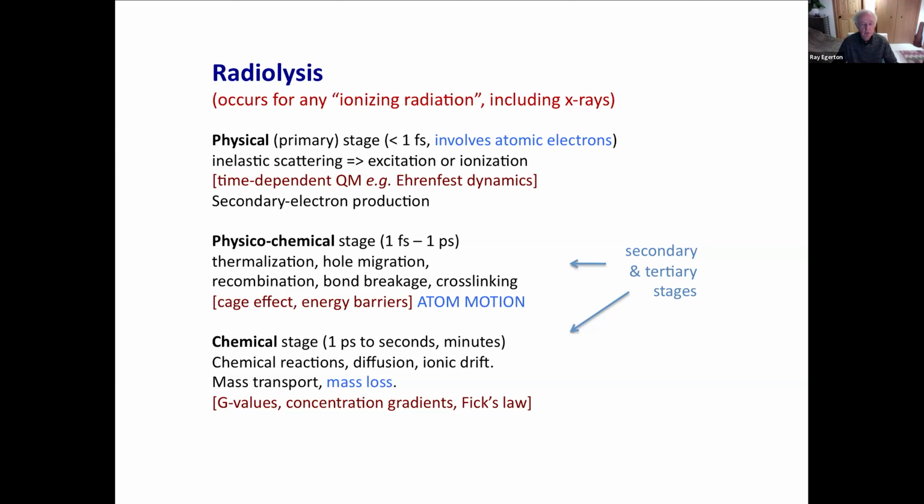And that's when we start to see effects in the image or in the diffraction pattern, because there we're looking at the positions of atomic nuclei. And then that is followed by a chemical stage, which is slower and can extend even to seconds and minutes, where chemical species created by the breakage of chemical bonds react with each other, they diffuse around, we have mass transport and mass loss.